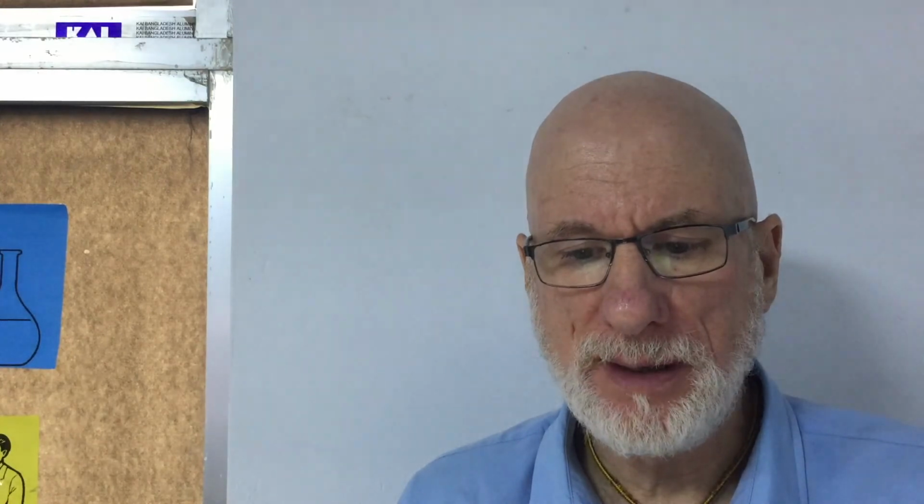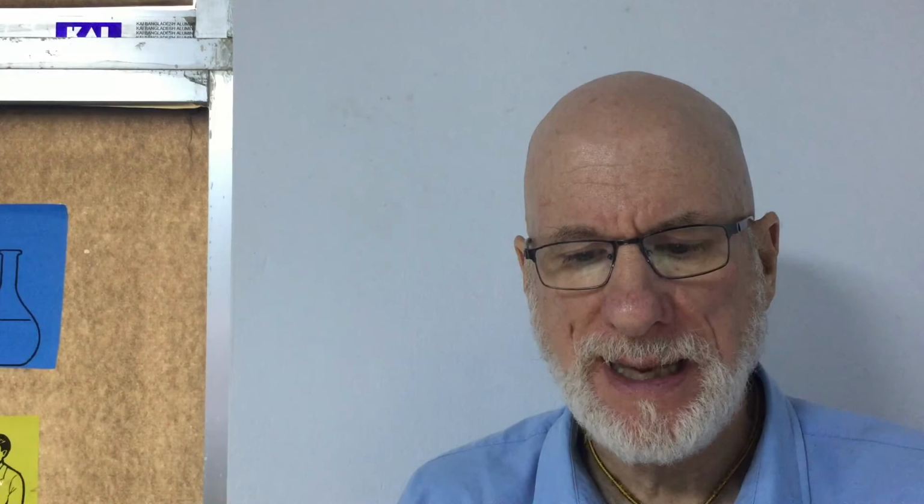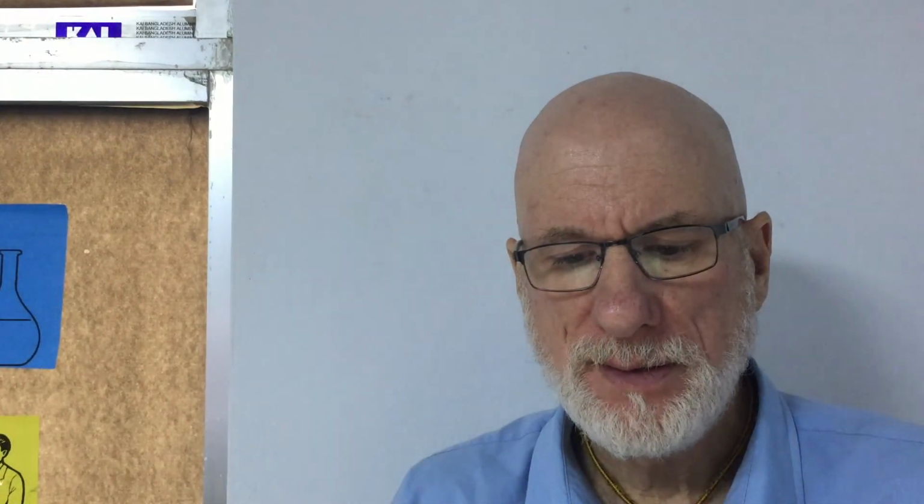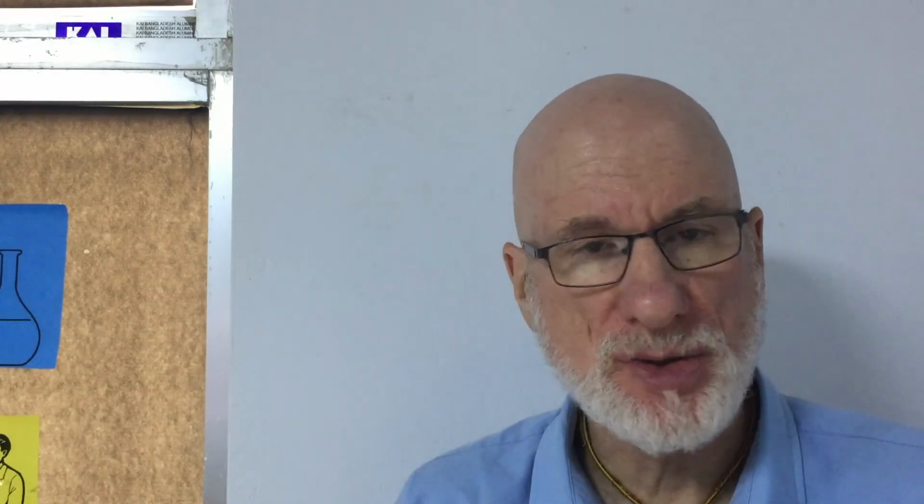Labels and equipment instructions, you have to read them carefully. You can't just guess what a chemical is for. Students are never permitted in the science storeroom, ever. That is the responsibility of the instructor or the lab tech, never a student. Know what to do during a fire drill. Every lab class will have a fire drill of its own, as well as with the school, and you need to know what to do.